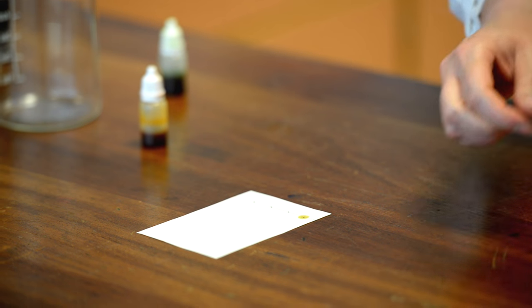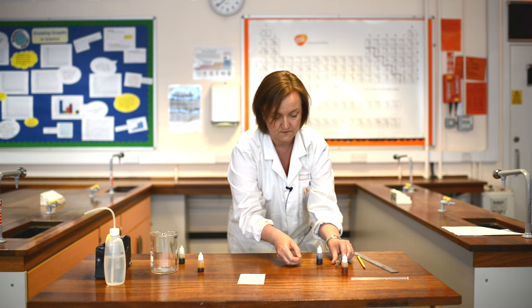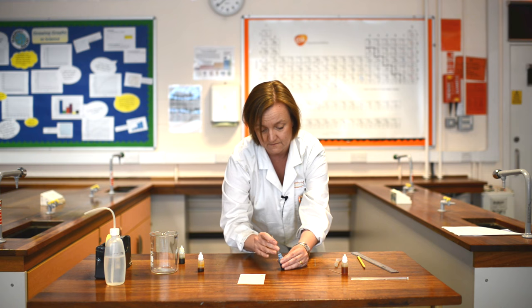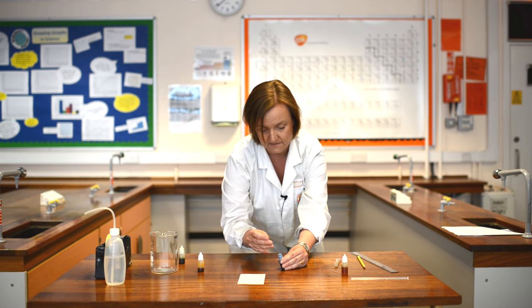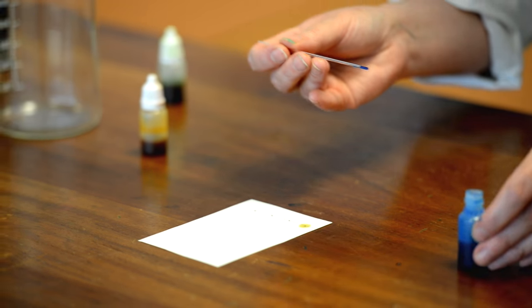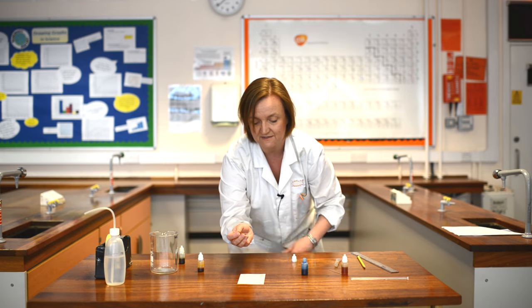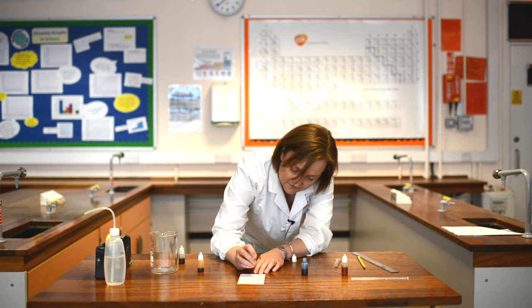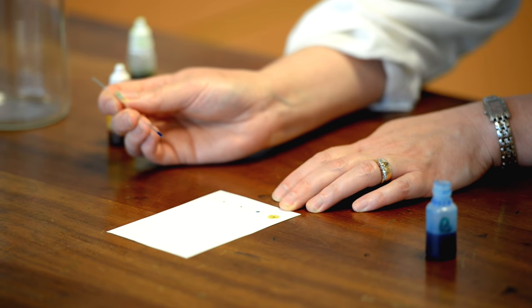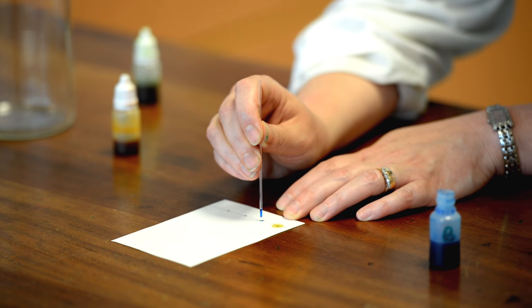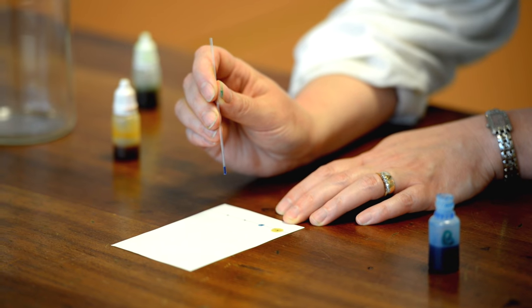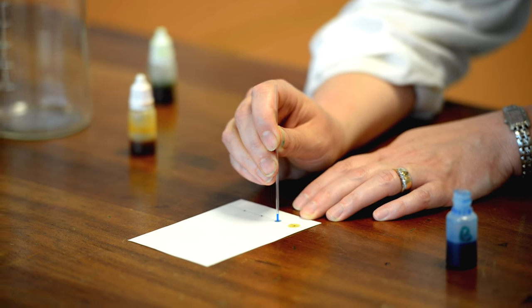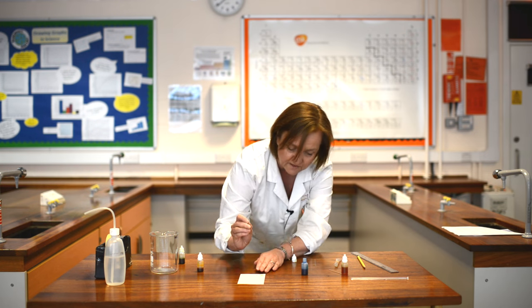So I'm going to repeat that now with the other colors. The next one I'm going to do is blue, another one of my pure colors. Again it just sucks a little bit up into the capillary tube, and now I'm going to touch that onto my second cross to give a little dot and repeat. I don't want it to go too big, and I certainly don't want it to start to merge with the yellow dot next to it. That should be enough.